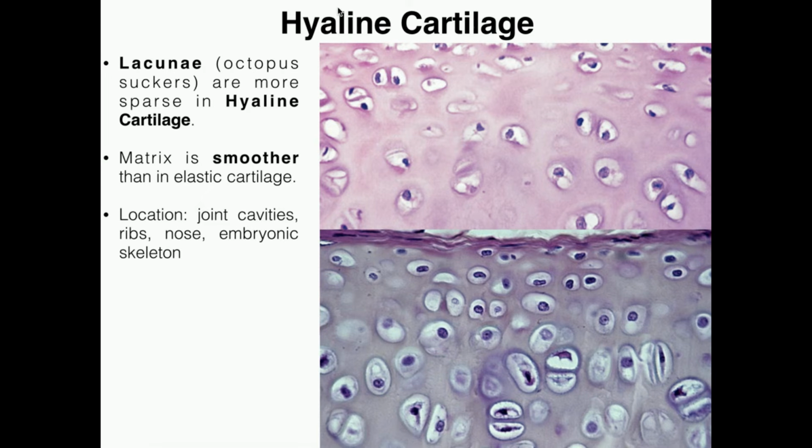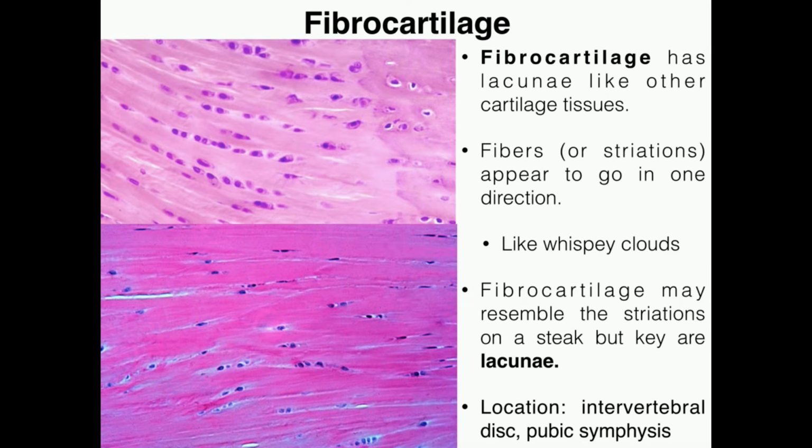And over time, it ossifies into bone. All right? The last type of cartilage also has lacunae. They're not as obvious. They look a little bit different, but you can still usually tell they're lacunae. Here's an example right here where my mouse is on the bottom image. You see here a chondrocyte surrounded in kind of a whitish space. All of these things are lacunae. You can see them up here at the top.